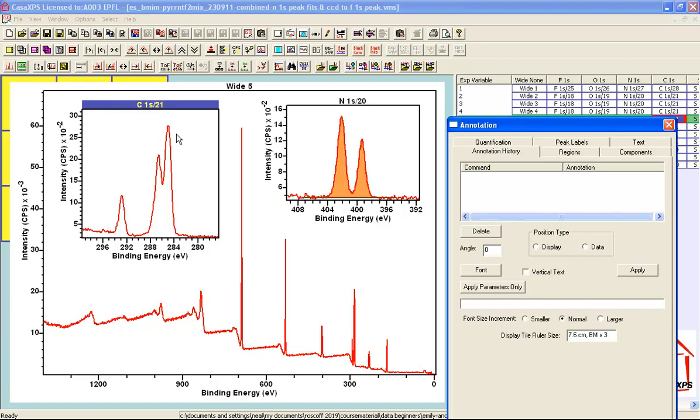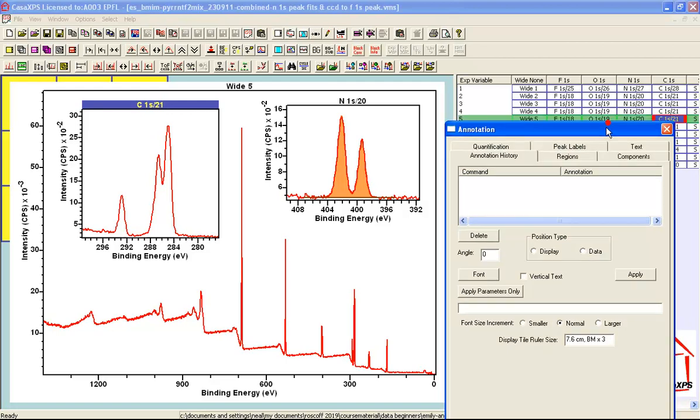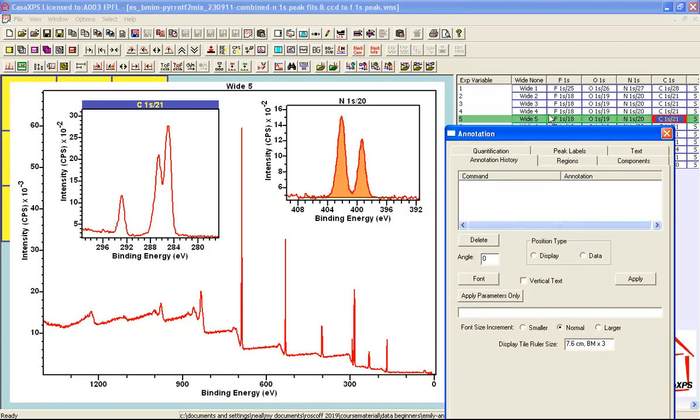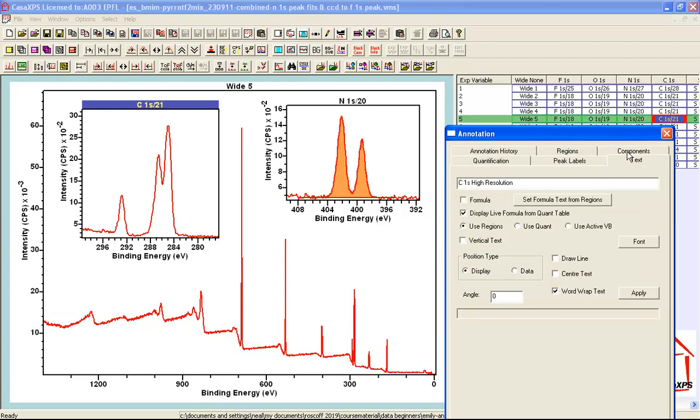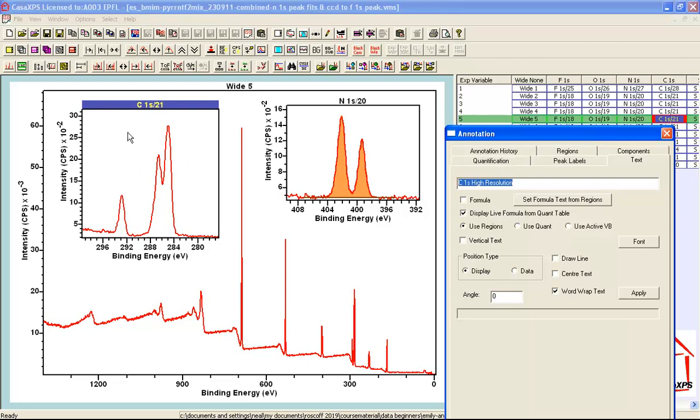The blue bar indicates this is the active tile. So if I wanted to add some text to this specific VAMAS block that is selected over here for the carbon 1S then I might go to the text property page and I have already entered C1S high resolution. So this text when applied will act on the VAMAS block and will appear in this particular tile.